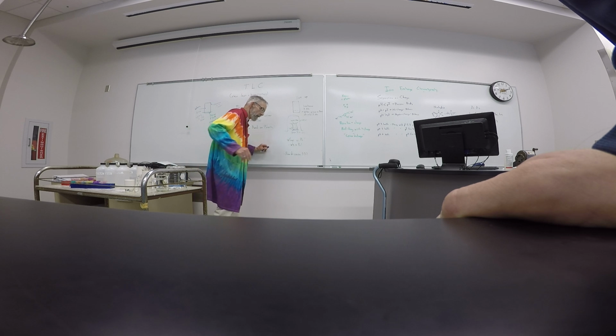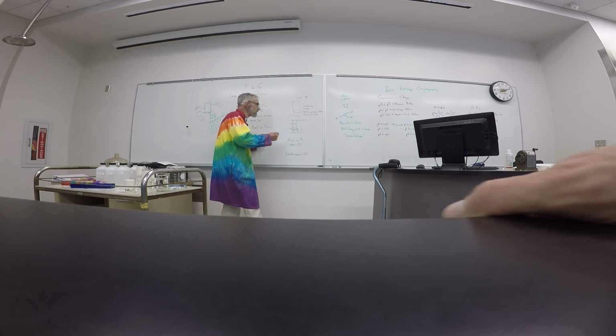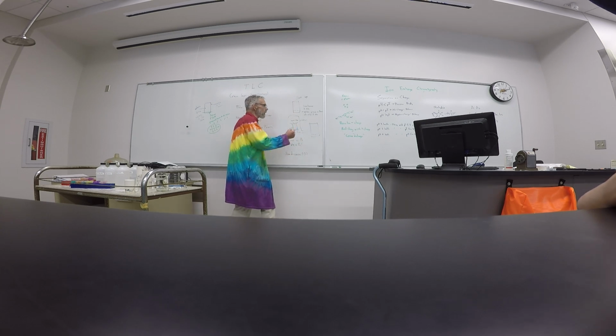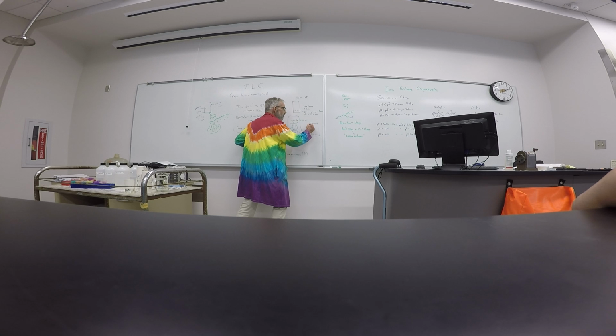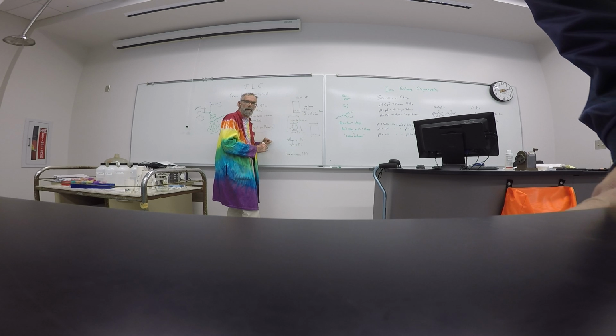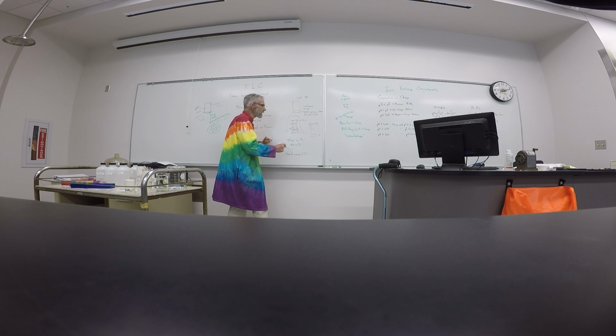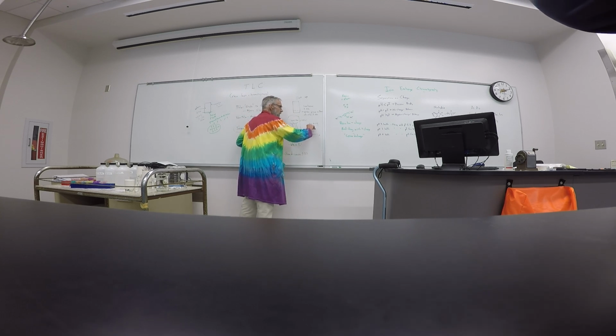Now when you look at it, when it's completely developed, you'll have your line with different spots there. And as you first pull it out, make sure at this point you write on it with your pencil again where that solvent actually got up to. And then the retention factor is, if this is one of your pure amino acids, you should have a spot there. This is another pure amino acid, you should have a spot there. The retention factor is simply: measure this distance, measure the total distance, and what fraction of this total distance this guy gained.